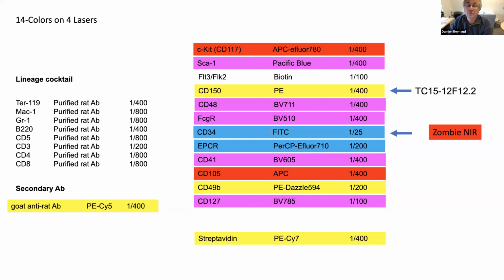I know that, and we have used other colors when needed. We have used BV421 and eFluor 660. So we make it work, but with high concentration like here, and we even need to extend the time of staining. So it's relatively difficult to handle in other colors. But FITC is the best if you use high concentration.